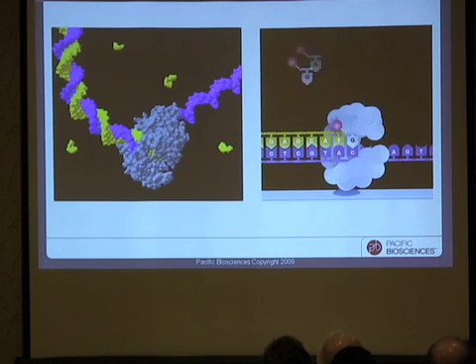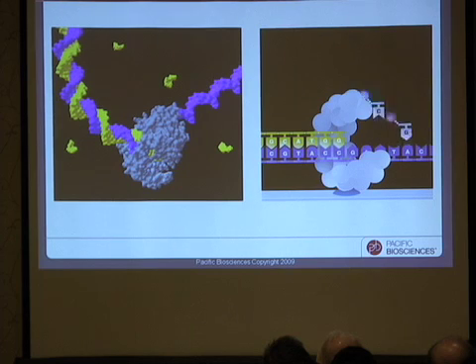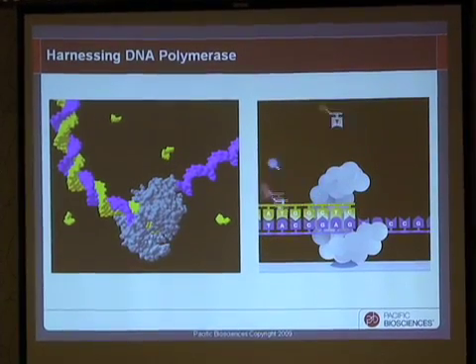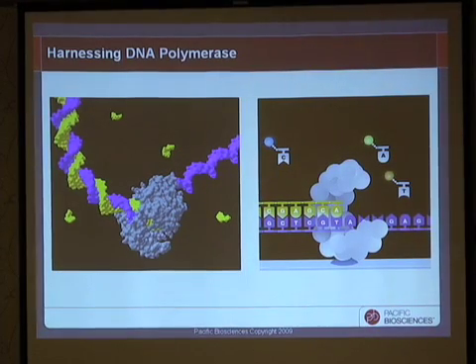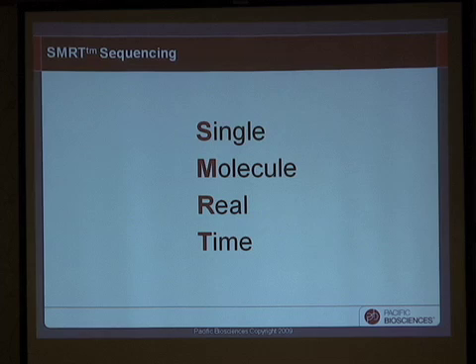read that complementary strand. The approach that Pacific Biosciences uses is to attach fluorescent labels to each of those 4 categories of nucleotides and then watch in real time as synthesis is undertaken. Every time a nucleotide is trapped in the polymerase, there's an opportunity to interrogate that fluorophore, thereby identifying, effectively you're eavesdropping or spying on the enzyme while it's undergoing template-directed synthesis. And in that way, we can identify the sequence. So you get pulses of fluorescent light from the sequence of colors. You would be able to then infer what the template sequence is. We call this single molecule real-time DNA sequencing.